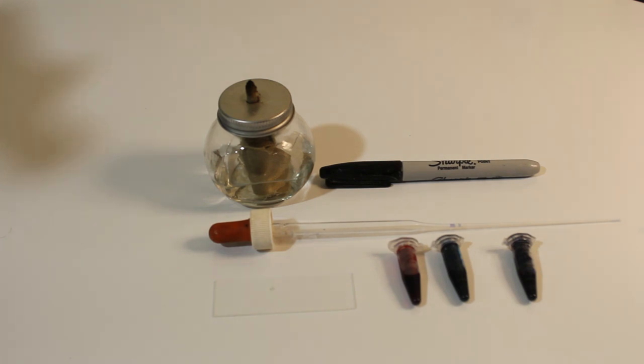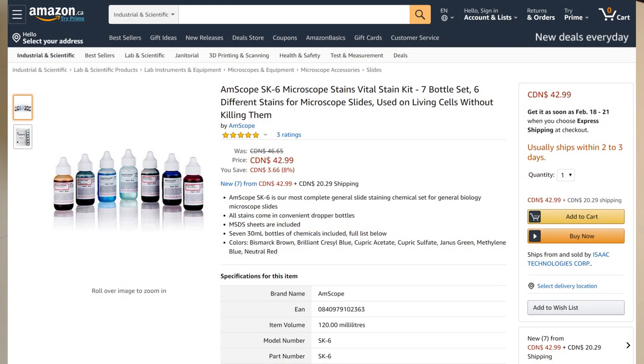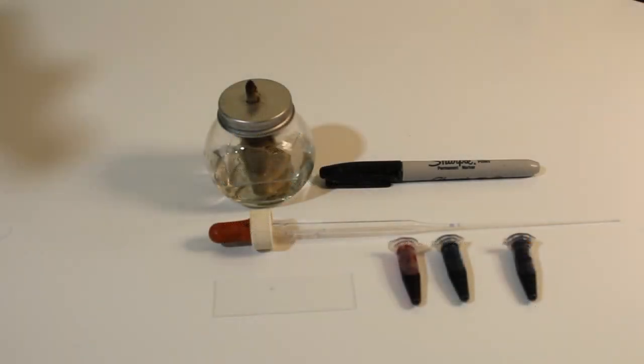Now here I'm actually going to show you three different dyes. This first one here is Saffranin, sometimes called Saffranin-O. This is probably one of the most commonly used microbiological dyes out there and you can often buy a prepared solution on Amazon. I prefer Malachite Green which is the sample in the middle, which can be a little bit harder to find, but which I find gives a more intense color to the stain. But a very easy option for most brewers to find is the Trypan Blue solution that you use for viability staining, which I cover back in Episode 7 as well as in Episode 8.